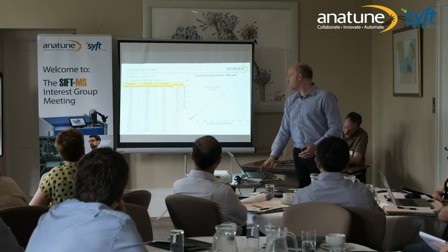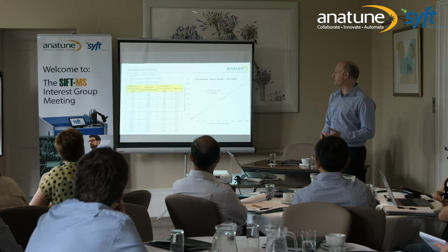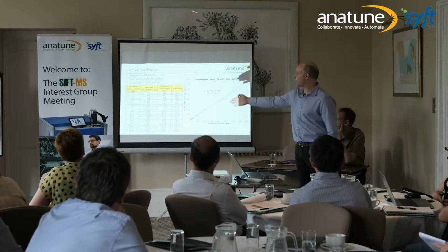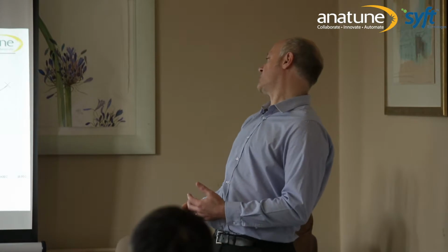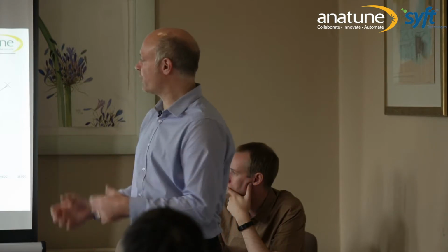So they reran the linearity, took out that top point, ran it up to 15 ppmV basically, and you can see now that all the recoveries based on that linear curve are now somewhere below plus or minus 20% of the recovery you would expect to see. Clearly a nice linear relationship. So the system is linear across, what's that? That's 3 or 4 orders of magnitude for formaldehyde, with an R squared of 0.9998, which is really good for a difficult analyte. So we've proved linearity.